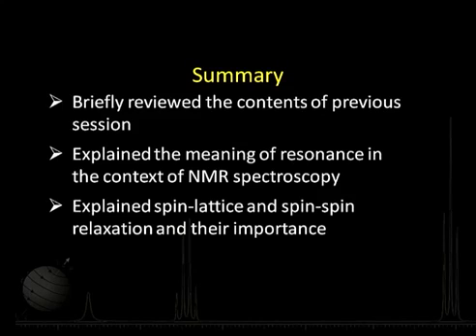And thereafter, we explained two important relaxation phenomena, that is spin-lattice relaxation and spin-spin relaxation, and their importance, because they are very, very important phenomena, particularly in terms of their being able to maintain the population difference, so that the energy absorption can take place and we can get a meaningful spectrum.